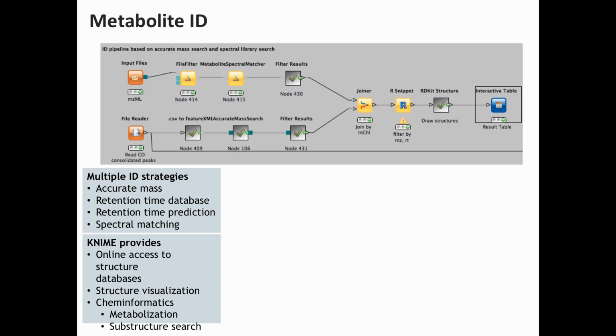And for those, you can then use accurate mass search. What we provided there is a list of compounds taken from, for example, MassBank. You have these compositions. You search with the accurate mass search after you define a list of potential adducts. You run that, and then here's this joiner node. What the joiner node does is it takes these results and merges them together in a way that you have both hits for every feature, for every original tandem spectrum. You have everything you know about the accurate mass, and then you can go over that list.